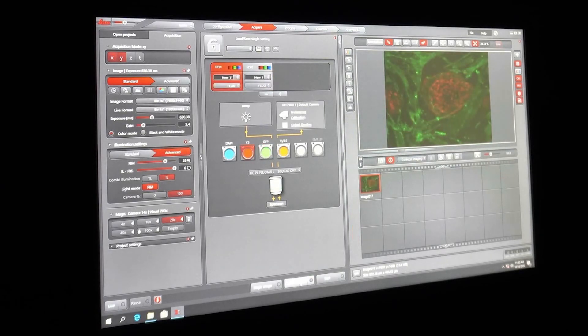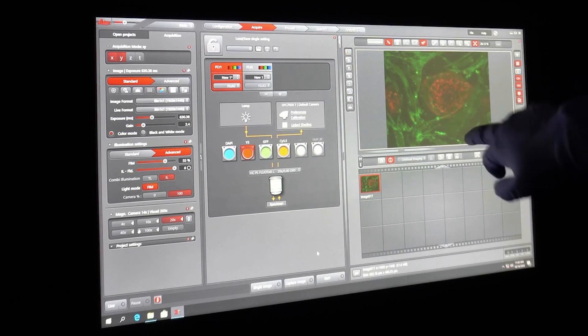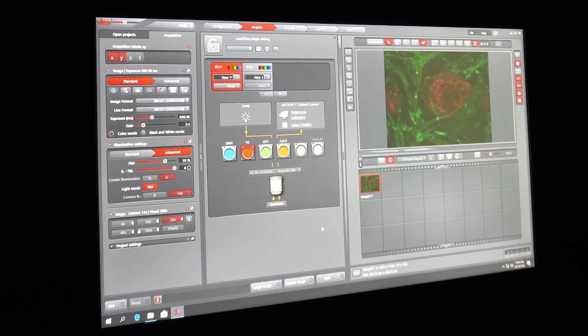You can now assess from this image how well your reprogramming has worked, and the presence of TRA-1-60 staining here indicates that it has been successful. You may also want to go back and adjust the settings further, as in this case the CD44 staining is a little bit oversaturated in comparison with the TRA-1-60 staining. It is also possible for the iPSCs to grow over the top of the MEF cells, so there may be some overlap between the red and green staining.